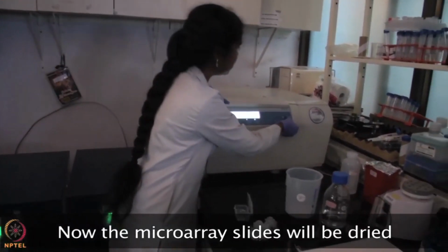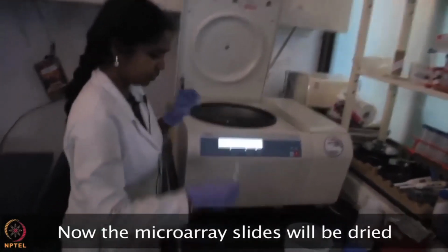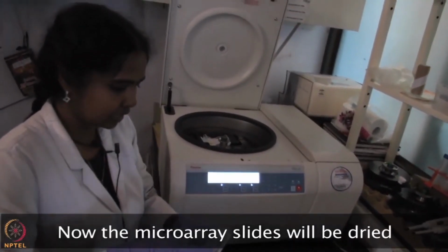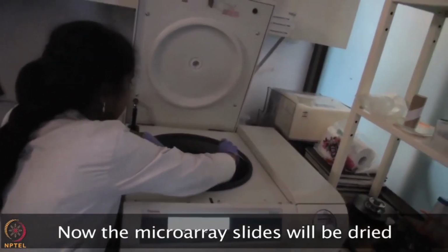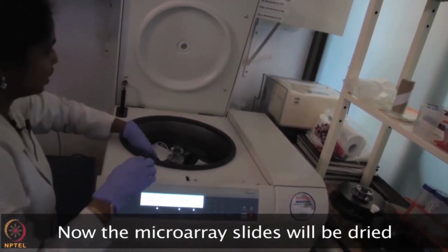So you just have to open the centrifuge, take the slide, keep it in the cassette, which is designed for the microarray experiment.